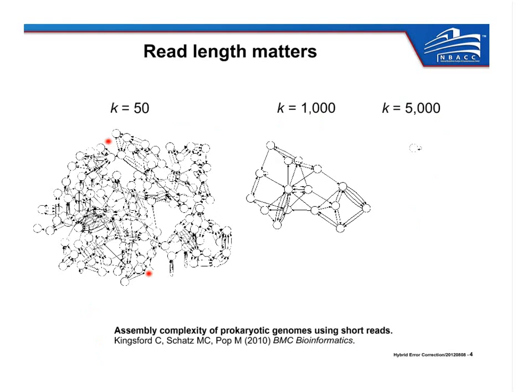As you can see on the left here, when you have read sizes of about 50 to 100, the assembly graph of even the most simple of genomes, like a K12, is extremely complex and filled with tangles. Each one of these edges that you see, the individual nodes you can think of as contigs, and the individual edges are relationships between, say, 2 adjacent contigs. In reality, all of those dots are contigs, and each of the edges represents potentially missing sequence information. So either missing in terms of you don't know which contigs go next to each other, or missing in terms of the assembler wasn't able to reconstruct a large enough piece of the genome, so you're left with a gap in your assembly.